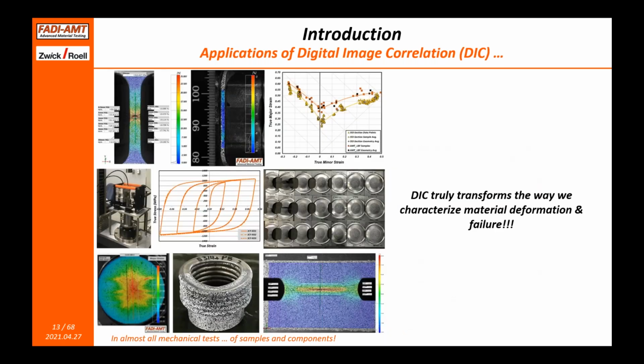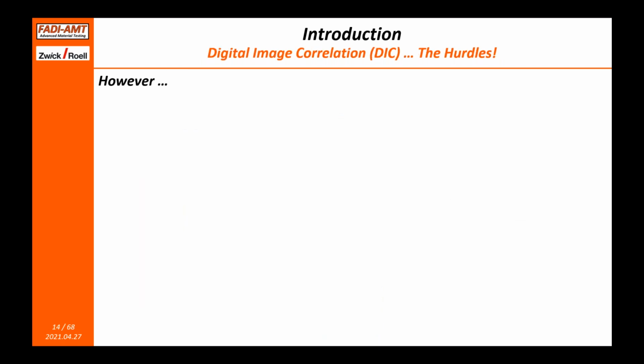Applications of DIC are of course limitless, and I've shown this in previous webinars that DIC truly transforms the way we characterize material deformation and failure. So there is no limit to what applications you can use DIC in.